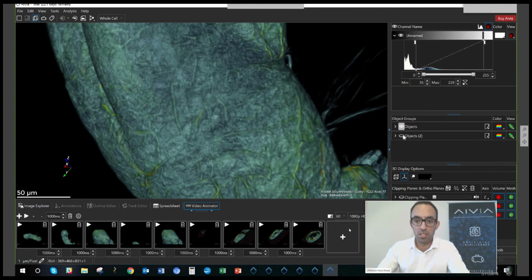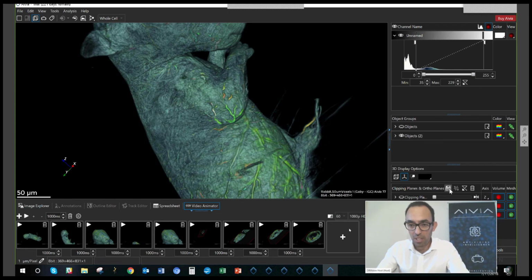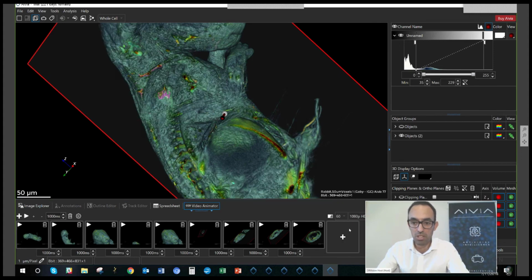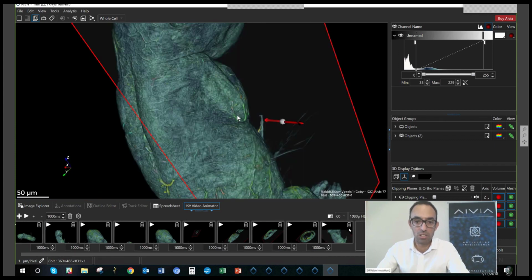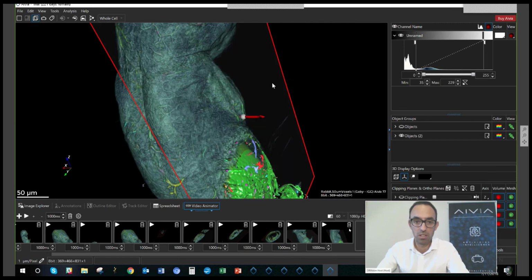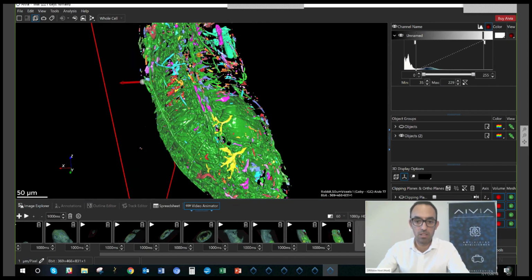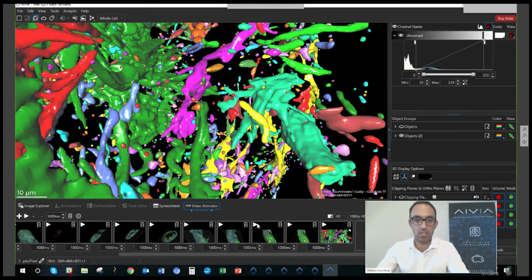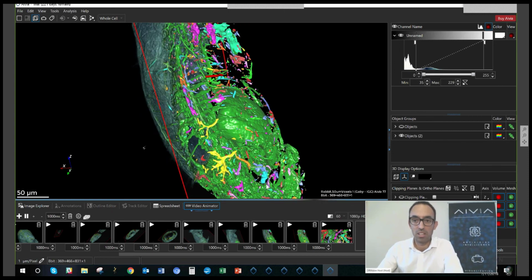Then I can introduce additional elements. So I'm going to add here the blood vessels, and I'll have a new clipping plane that will strip away the volume and leave the segmented results. So I'll start it here, rotate it, and then gradually move it over. And that's this last portion. So it's slowly stripping things away and adjusting.